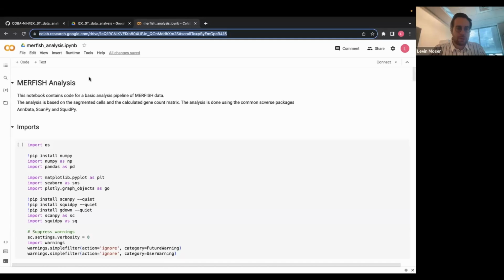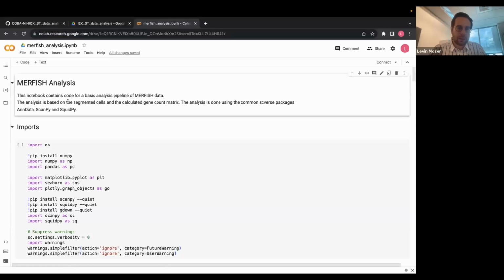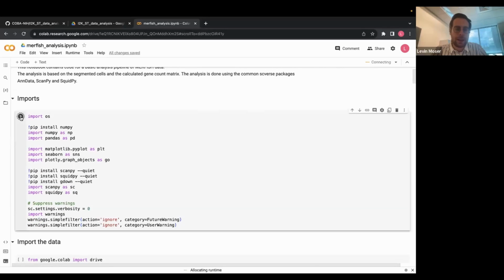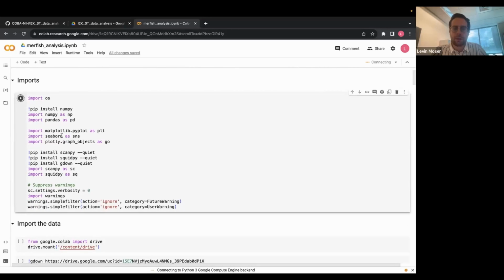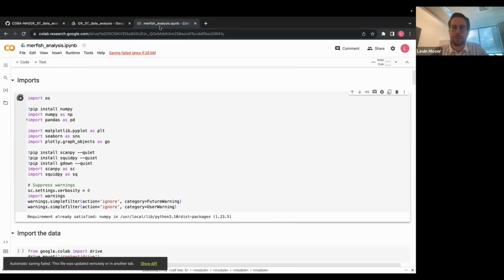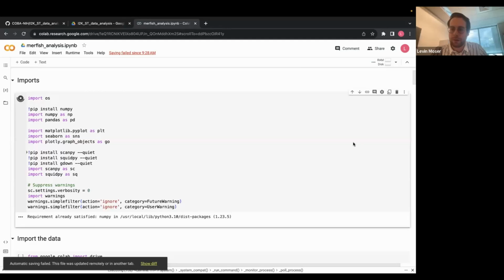Okay, so let's get started with the more hands-on part of this workshop. If you don't want to follow step by step on your own, feel free to just watch and let me explain to you what I'm doing and what's going on. But if you want, it's great if you also follow on your own in the Colab.